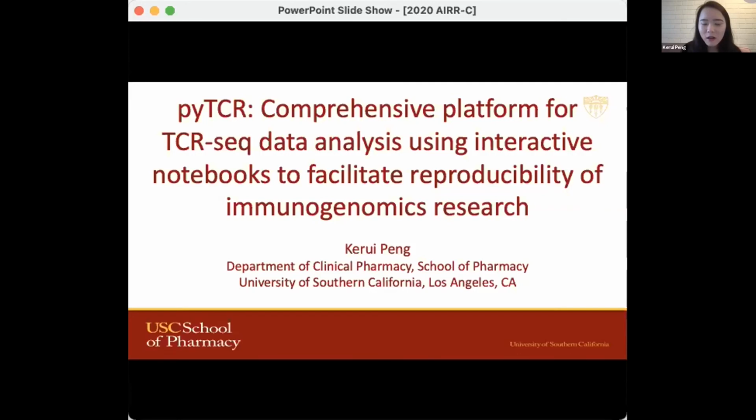The motivation for this work is that we have seen biomedical researchers with limited background have a hard time learning and using these tools. And when they type code, sometimes they don't know what filtering is behind the tools. It's like a black box sometimes.